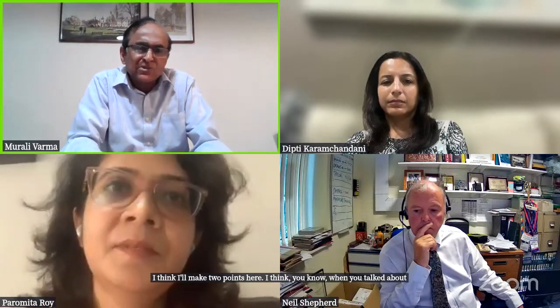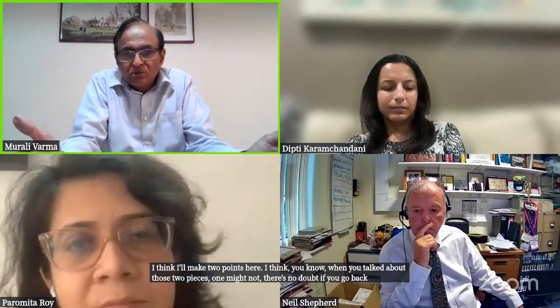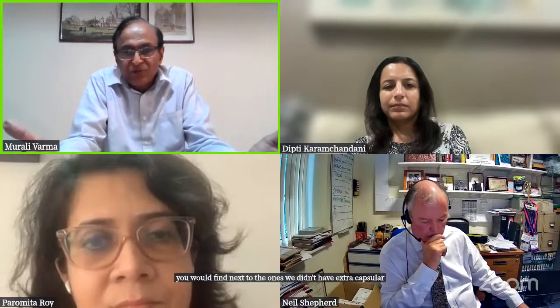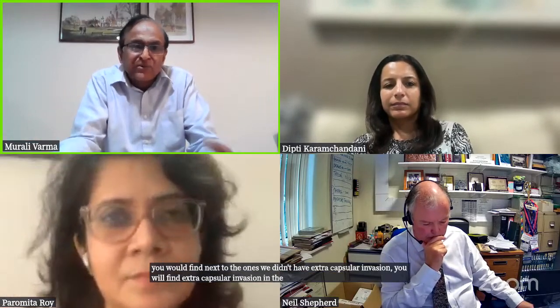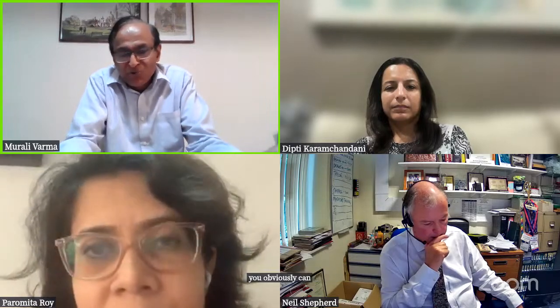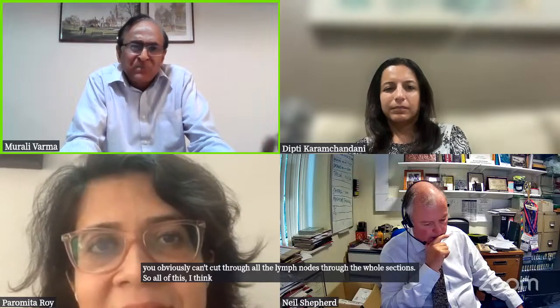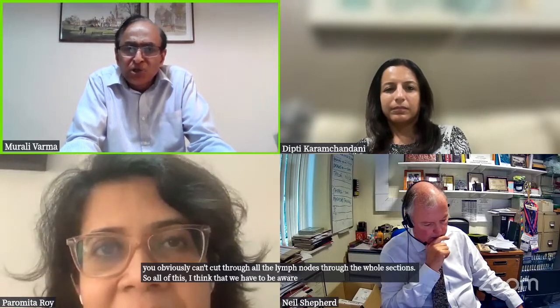Okay, Murali? I think I'll make 2 points here. When you talked about putting in those two pieces, one might not show it. There's no doubt that if you go back and take deeper levels through those blocks, you will find extracapsular invasion in the ones where we didn't see it. And then it's a question of how many levels you take. You obviously can't cut through all the lymph nodes through the whole sections. So we have to be aware that the sampling error is huge.